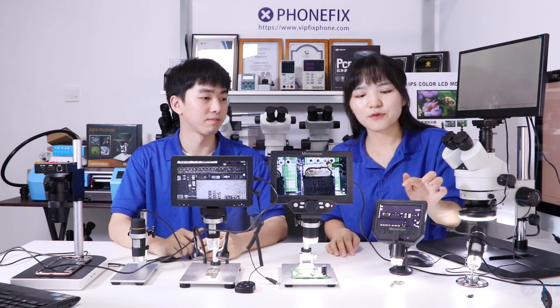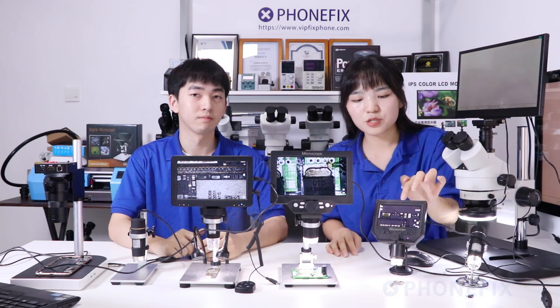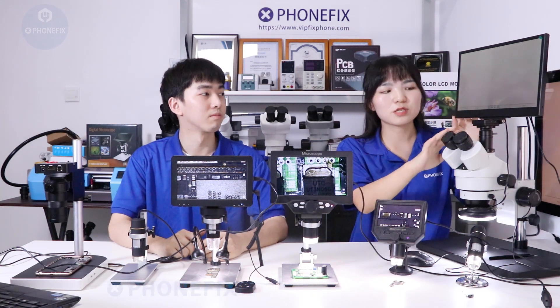There are 3 kinds of microscope with different LCD displays. Like this one, it has a 4.3 inch display. The others have a 7 inch LCD display. And the last one has a 13.3 inch monitor.